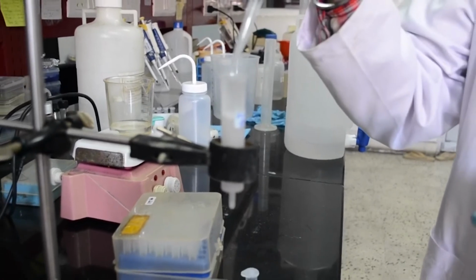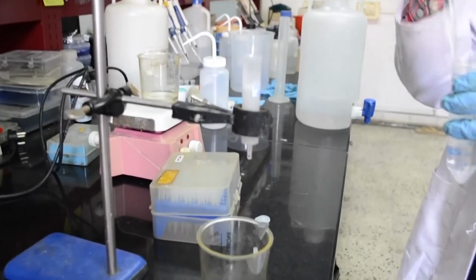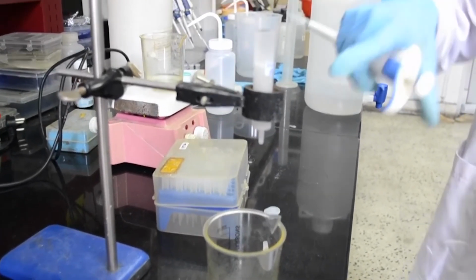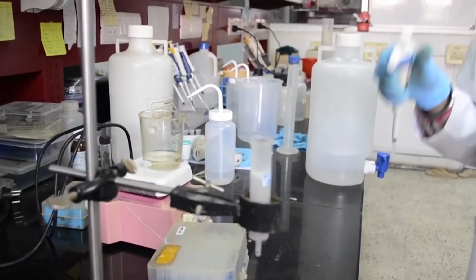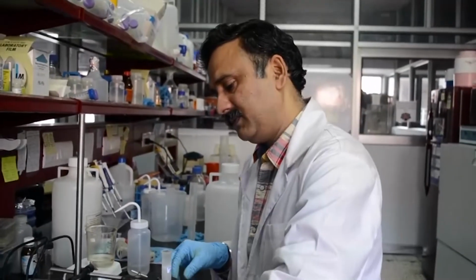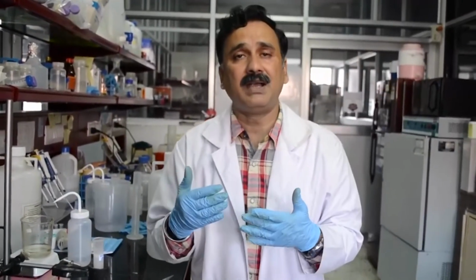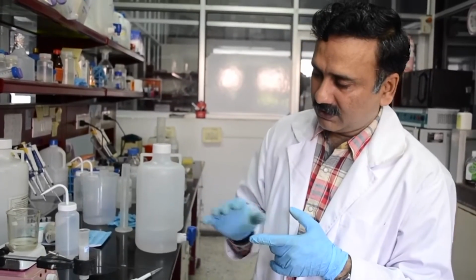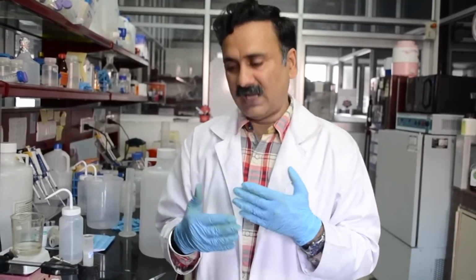So, while you are adding, you have to ensure that there is a smooth flow of buffer from the lower end of the column, and also that there is no particulate matter on top of the top filter, because that top filter is kept simply to avoid exposure of the column material to particulate matter or aggregated proteins. So that's why it protects the column from any kind of damage.